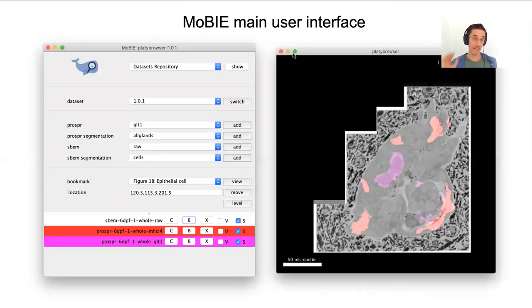So if you hit enter on Fiji, then it will look like this. You have a main user interface where you can select from the different image sources, and you can then also change color and brightness and so on. What you see here on the right is now the electron microscopy on top. And on top of this, two light microscopy images, which indicate gene expression patterns. For example, here a gene that's mainly expressed in neurons and another gene that's mainly expressed in muscle cells. And as mentioned earlier, one can easily overlay them even though they have completely different resolutions.